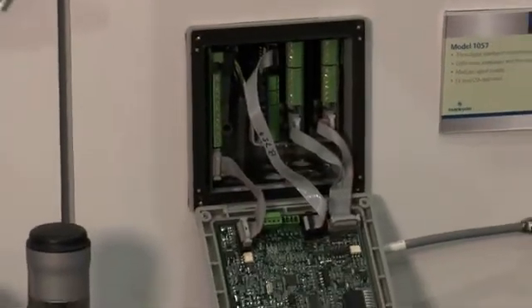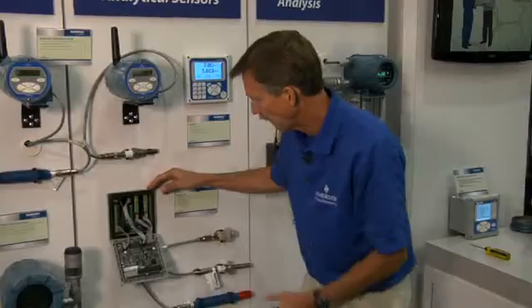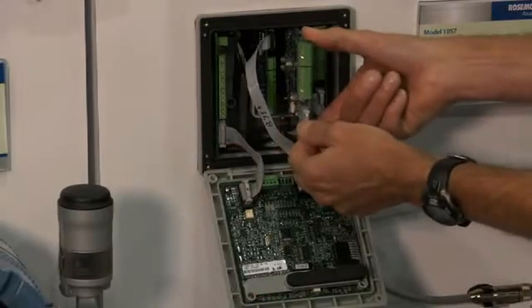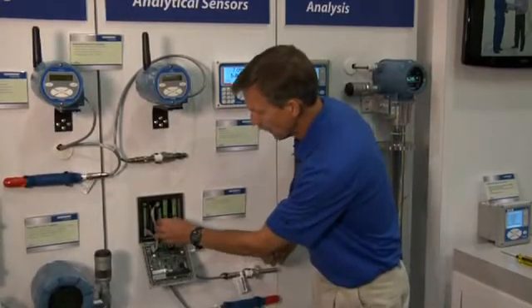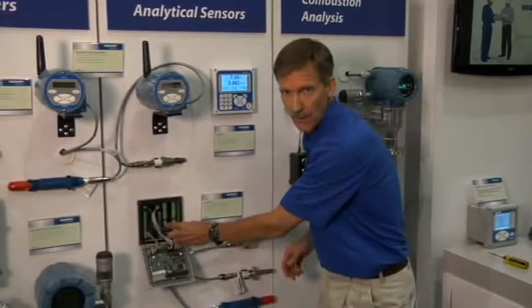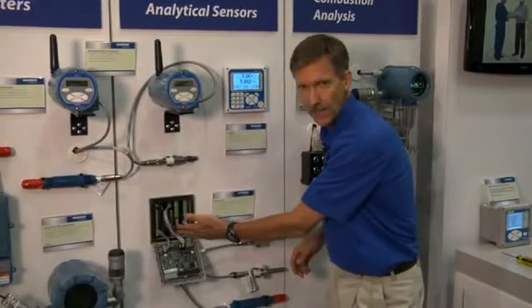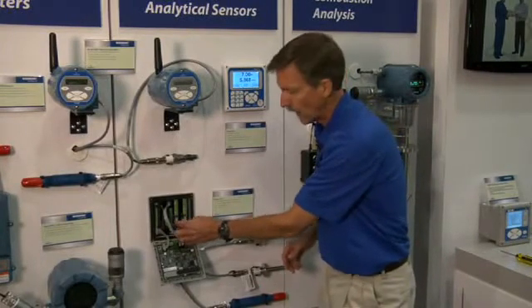Here is the inner workings of the Model 1057, and here you can see up to three signal input boards can be installed in the unit. To install a new sensor input board, simply remove the modular connector on the signal board, remove the signal board itself, and then install a new signal board. Placing it back in and then putting the modular ribbon cable back in place, you can install one, two, or three signal input boards — these are live inputs of pH or contacting conductivity in any combination — so one can add additional measurements to allow three live inputs to be read by the analyzer.